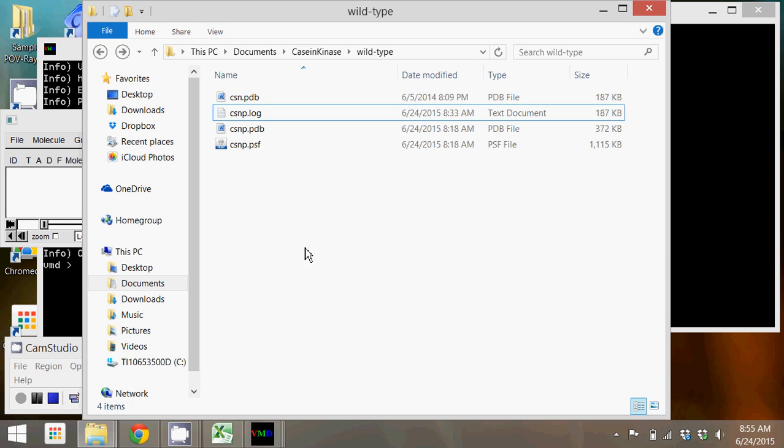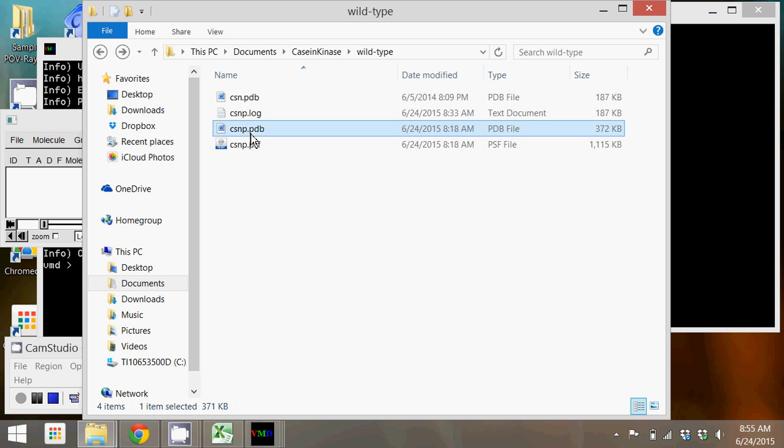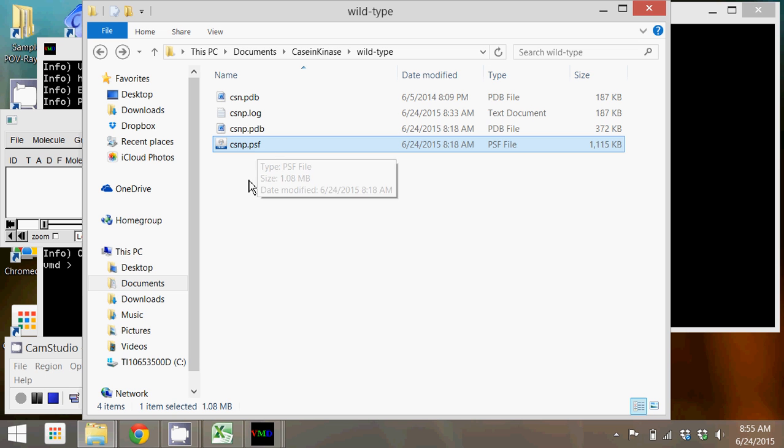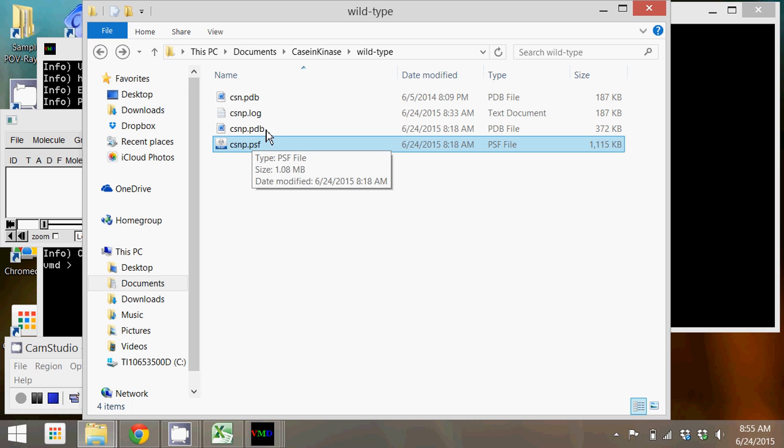In this tutorial I'm going to show you how to solvate a protein or enzyme using VMD. The files I'm going to be using are this file CSNP.PDB and CSNP.PSF.